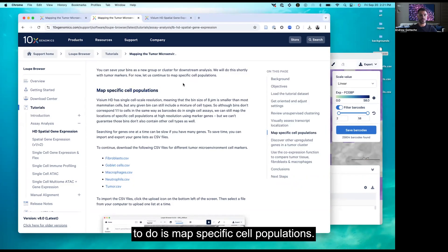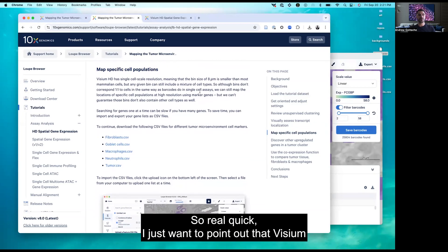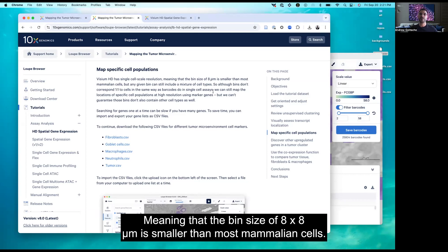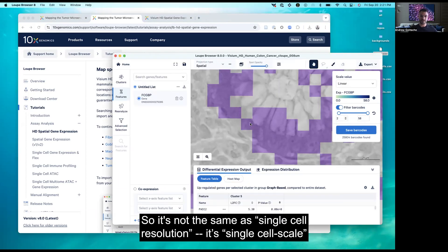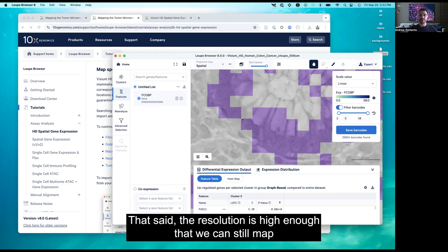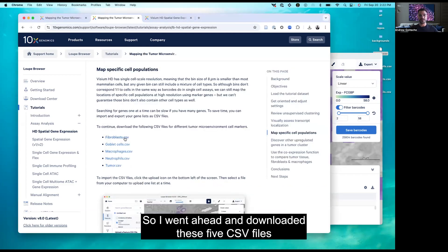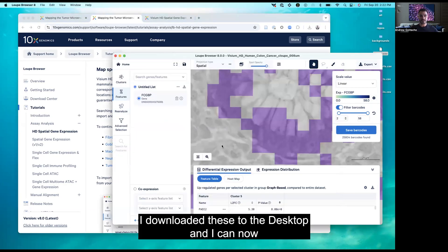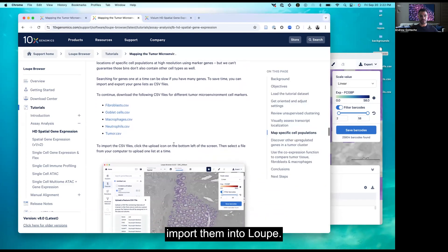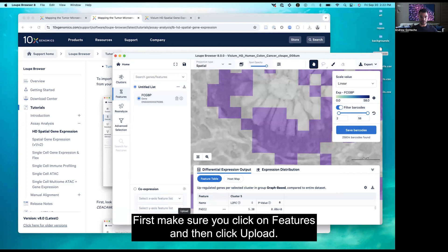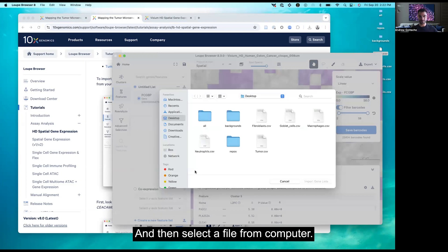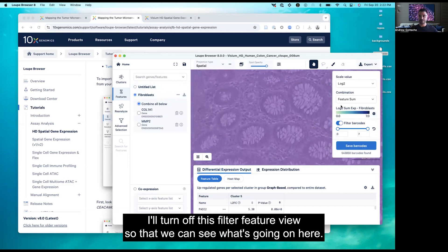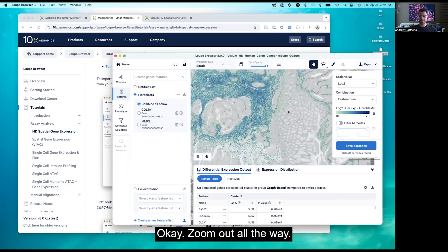The next thing we want to do is map specific cell populations. Visium HD has what we call single-cell scale resolution, meaning the bin size of eight microns is smaller than most mammalian cells — so it's single-cell scale, not single-cell resolution. That said, the resolution is high enough that we can still map interesting populations. I downloaded five CSV files included with the tutorial to the desktop and will now import them into Loop. Make sure you click Features, then Upload, then select a file from Computer. I'll choose Fibroblast first and zoom out.